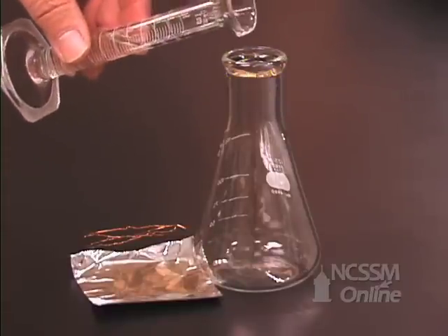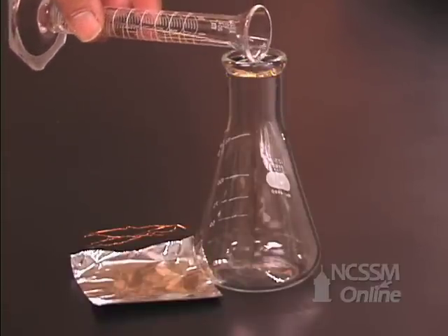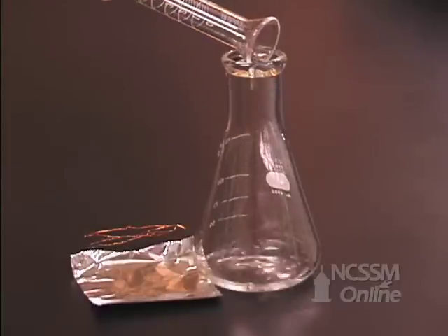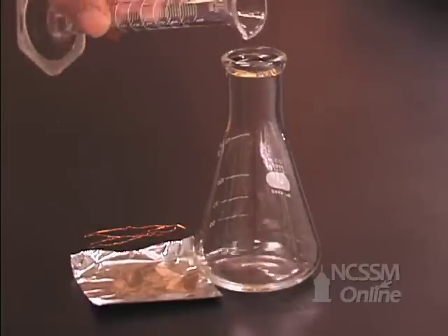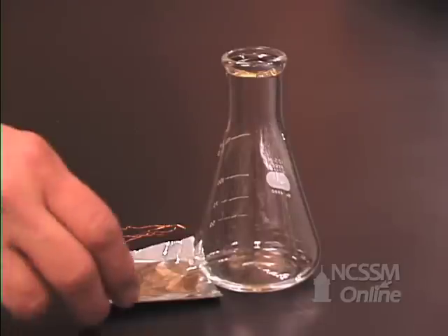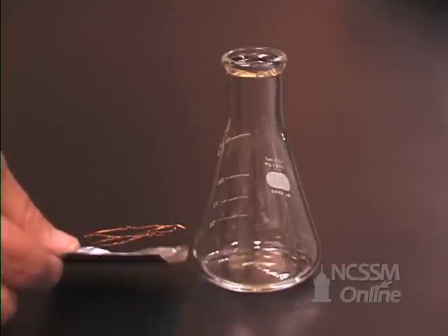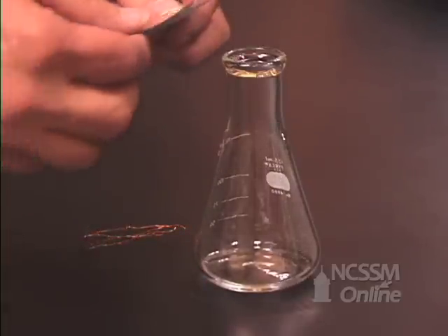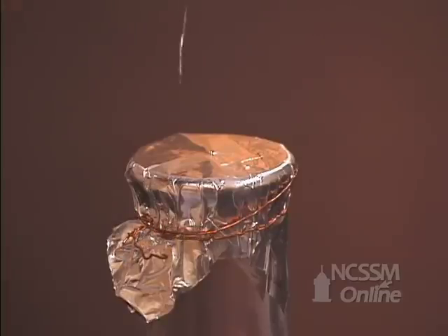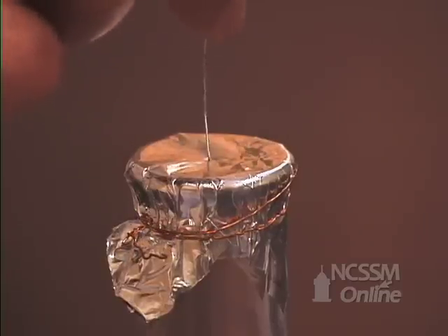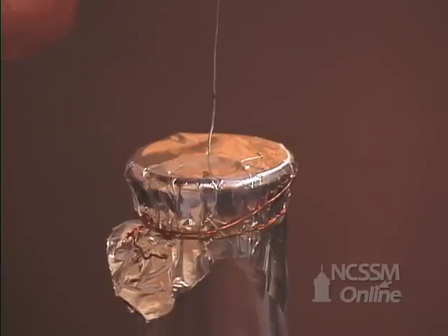We will then add approximately 5 milliliters of the unknown liquid. We will cover the mouth of the flask with the aluminum foil. We will use the copper wire to hold the aluminum foil in place. We will place a small pinhole in the top of the aluminum foil.